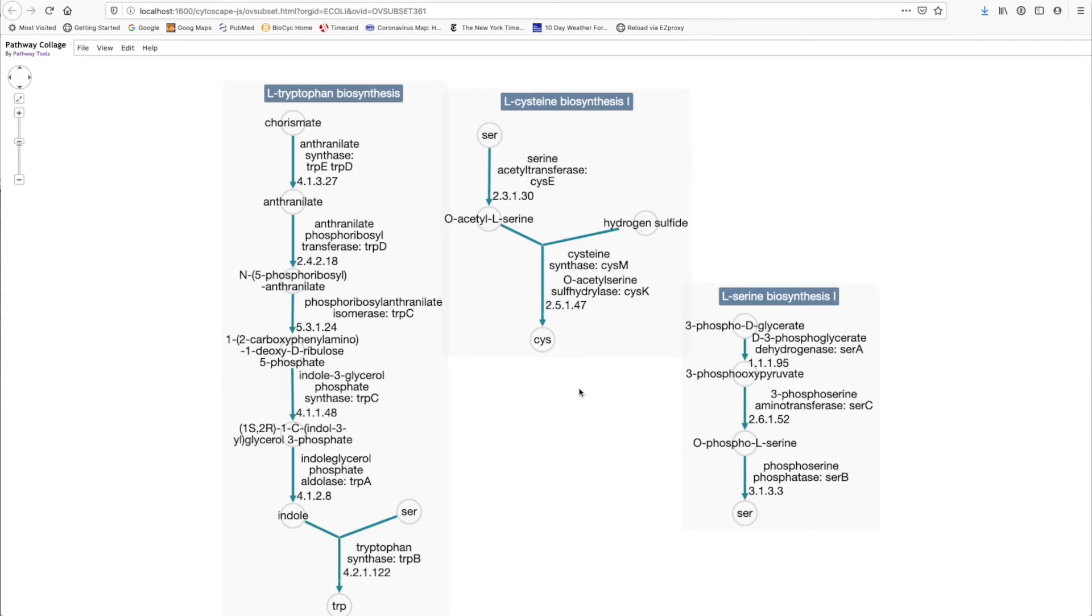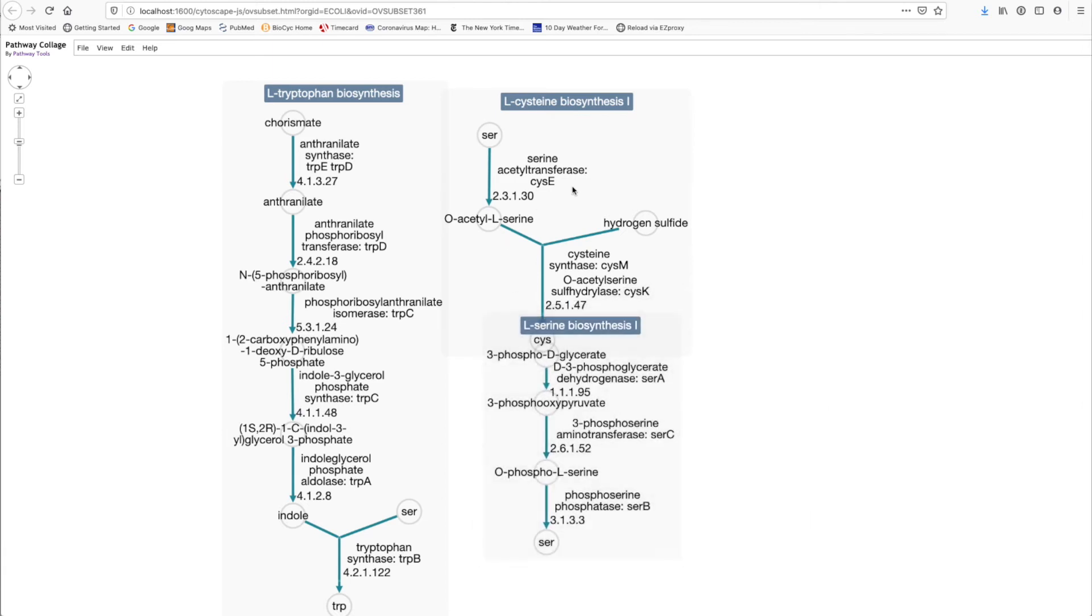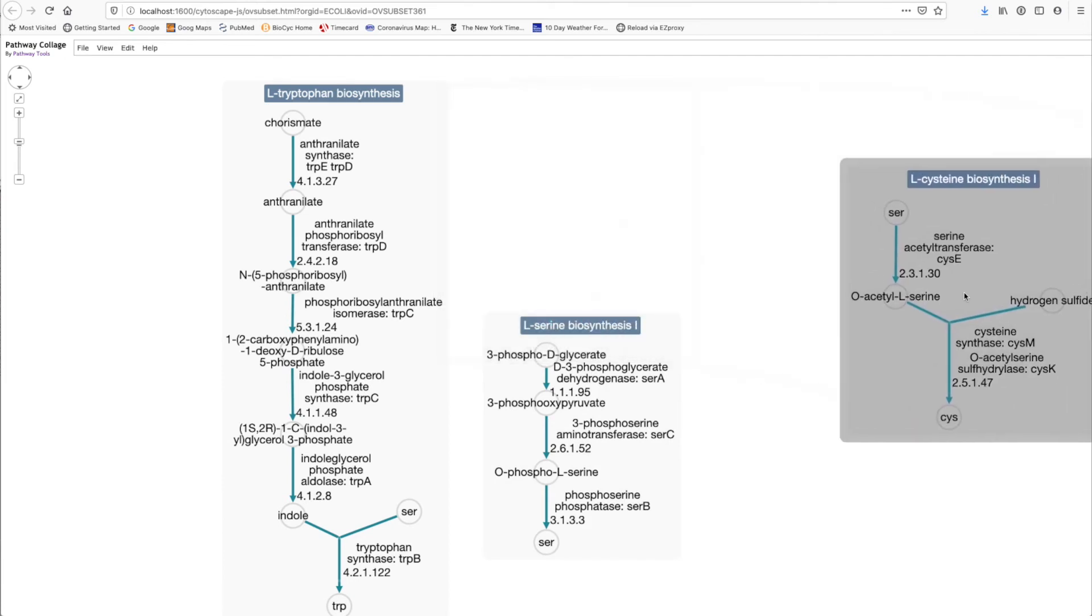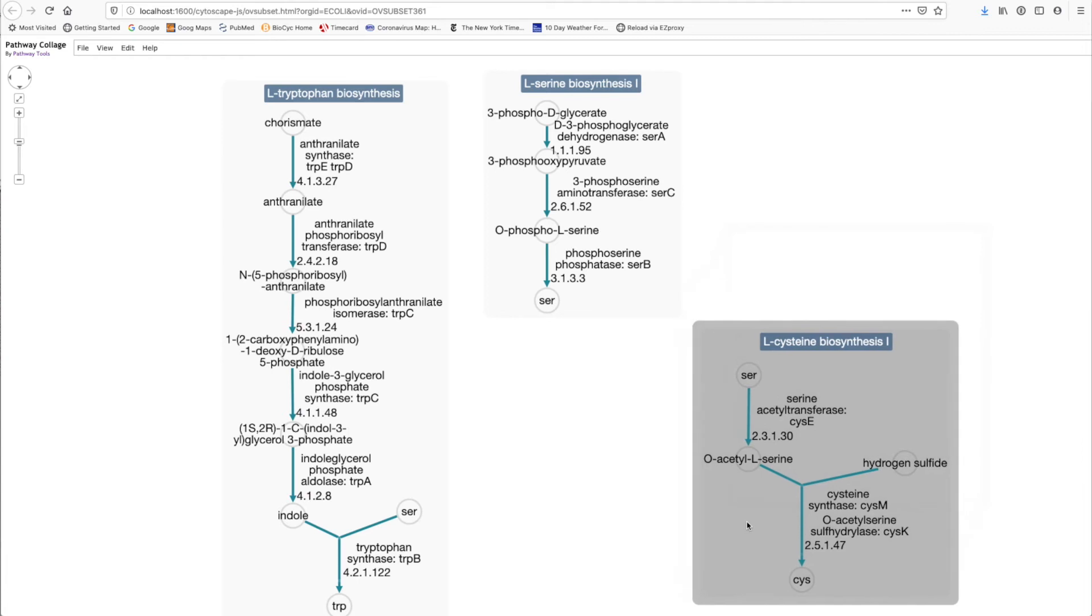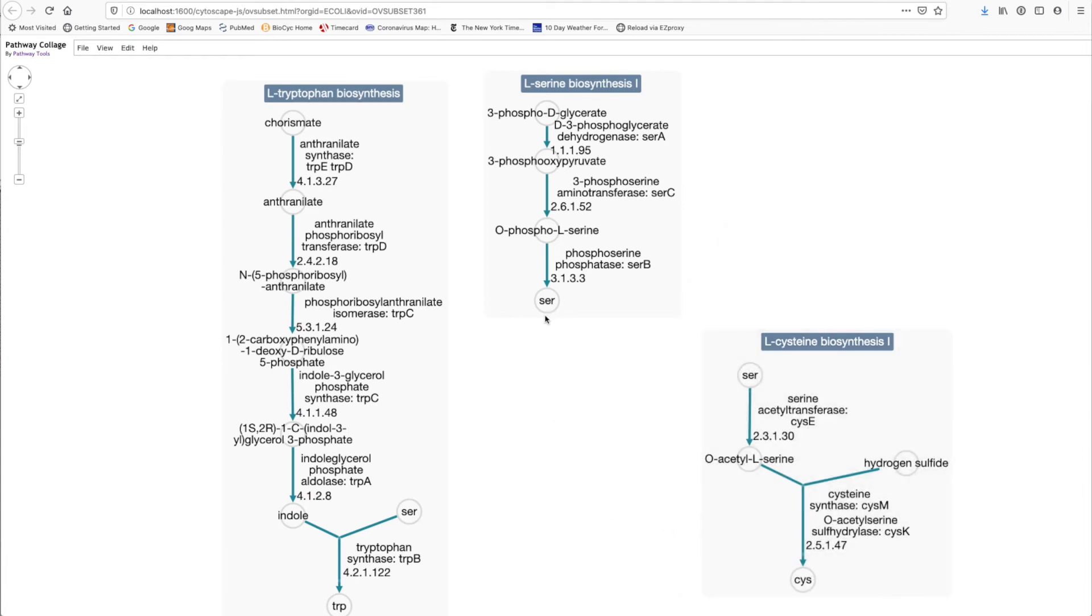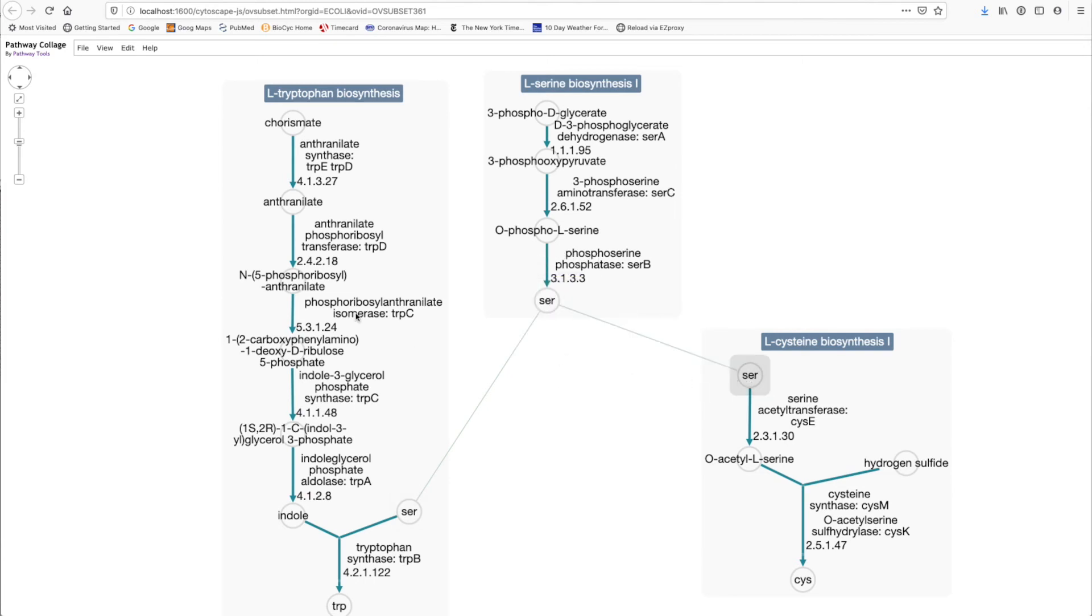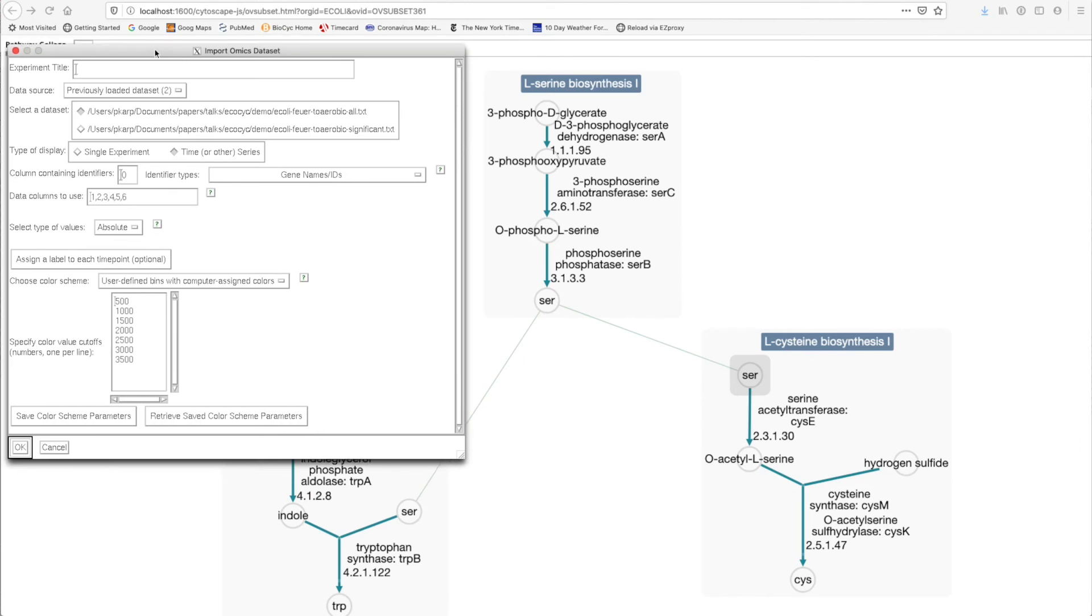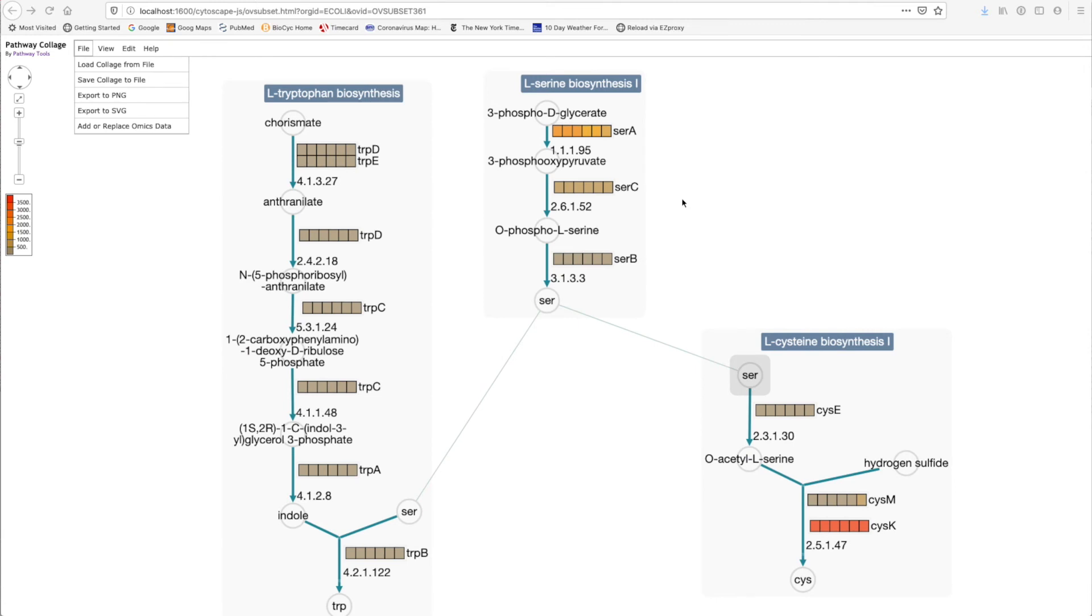This tool is called the pathway collage, and it lets us arrange multiple pathways on the screen to personalize the pathway diagram. For example, we can rearrange these pathways like so to try to accentuate the fact that this pathway synthesizes serine. These two pathways consume serine, so we can add these connections like so. We can overlay expression data. We can add omics data to the diagram, in this case in the form of heat maps.